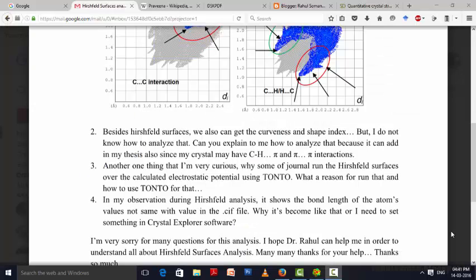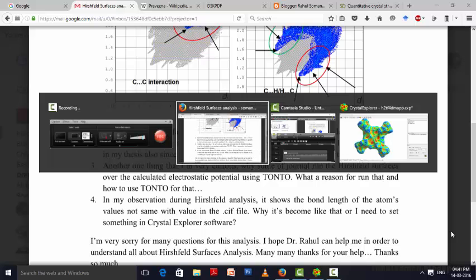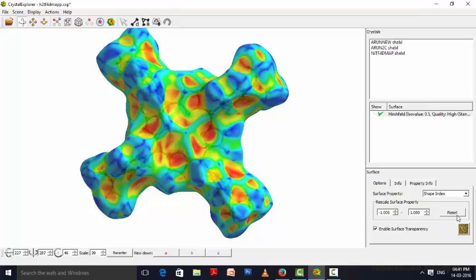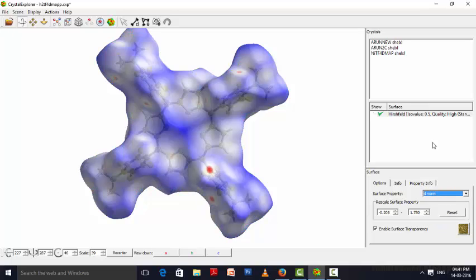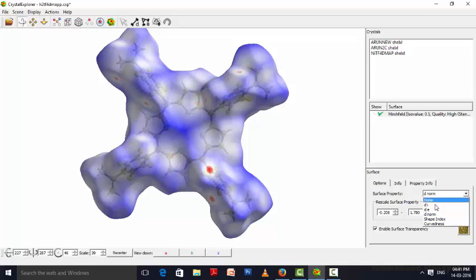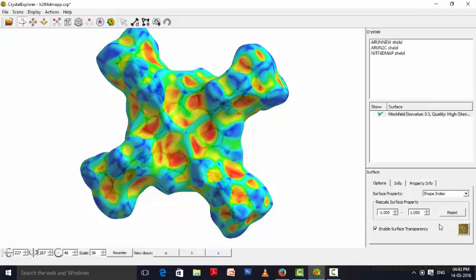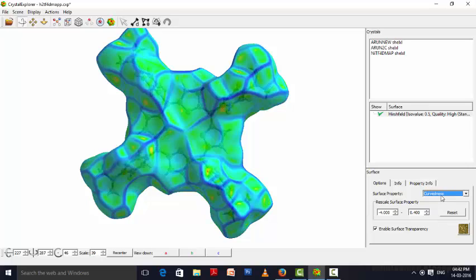Your second question is about curvedness and shape index. First I will show how to make this curvedness and shape index. If you are having a Hirschfeld surface, the surface property will be d-norm. So if you are changing simply the surface property to shape index, then you will be getting it easily. You can save it as a PNG image, and later you can change it into curvedness also. This is how you are making the shape index and curvedness from your Hirschfeld surface.